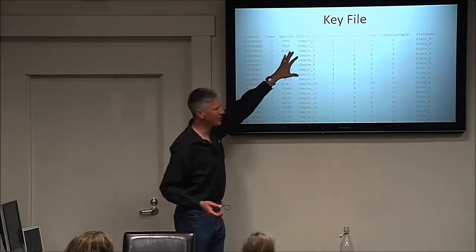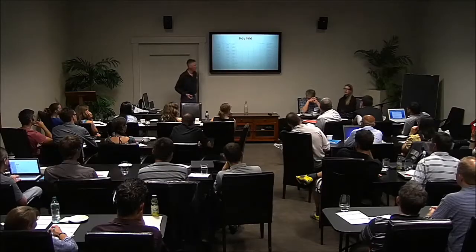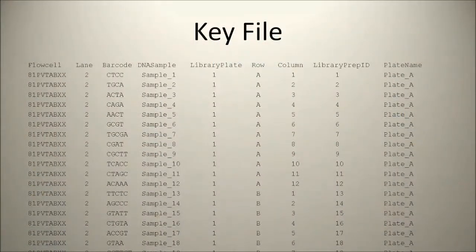And we can get into details about naming things. Actually, Katie, do you want to do that now? Yeah, I'll just say, because it's not in a slide anywhere, a lot of times people submit things that are either technical or biological replicates. If you think at some point down the road you want to merge that data, in this particular spot where it says DNA sample, when you're submitting your spreadsheets to IGD, make sure that those samples are named the same. With all the other information that's there, we're going to know which one it was, so it can be separate if you want it to, but if you want it to come together at some point, you have to name the samples the same, otherwise it's a really big pain in the butt, okay? Because that's putting it lightly.